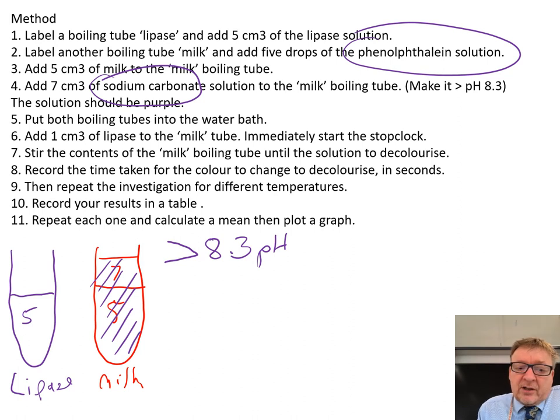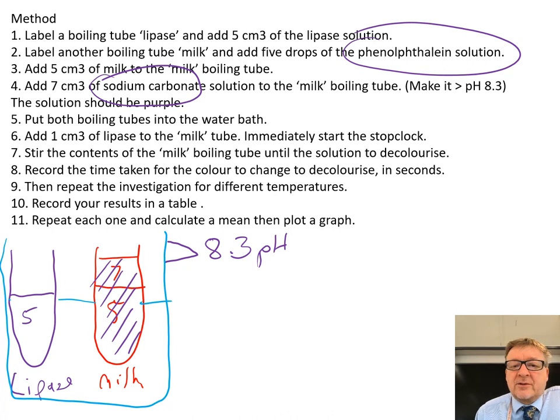You have lipase 5 cm³ and milk with sodium carbonate and phenolphthalein as a purple liquid. Put them both in a water bath and start at 40 degrees Celsius. Once they reach the right temperature at 40 degrees Celsius, take 1 cm³ of the lipase.